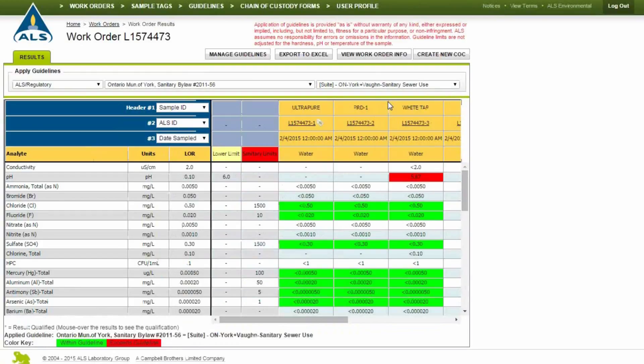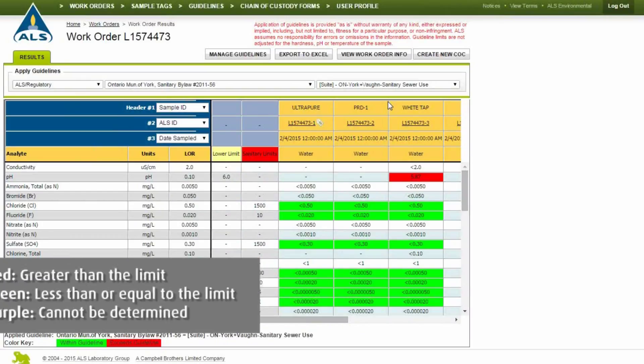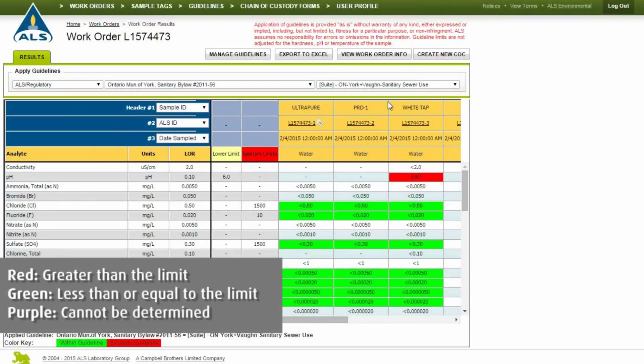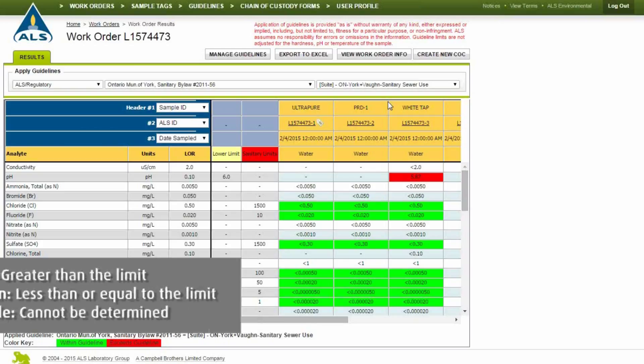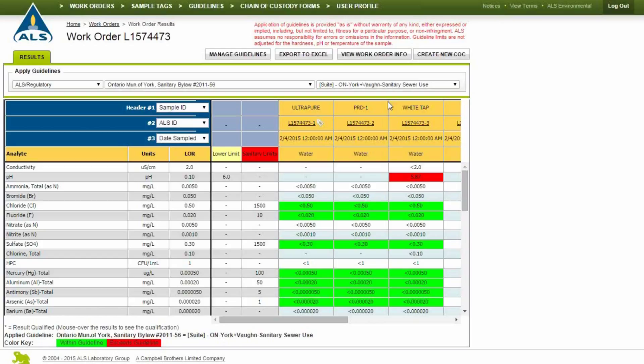When the guidelines have been applied, all results that have limits will be tested to see whether they are greater than the limit, shown in red, less than or equal to the limit, shown in green, or cannot be determined, shown in purple. Mouse over cells that are highlighted in red or purple to view the category failures associated with the result.